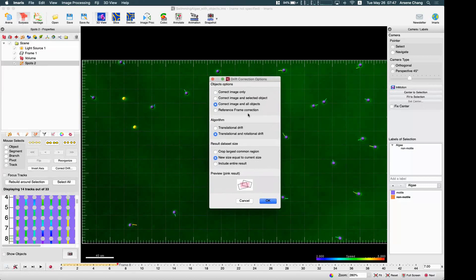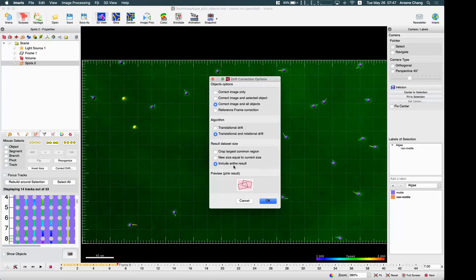Then there is the result data size. In this drift correction, Imaris will resample the image, so we have options for the result data size depending on the degree of drift. If you see a lot of drift, your result image with 'Entire Result' selected will have a lot of empty space to compensate the drift. Usually we select the middle option to create a new size equal to the current size, just to get rid of that extra space.